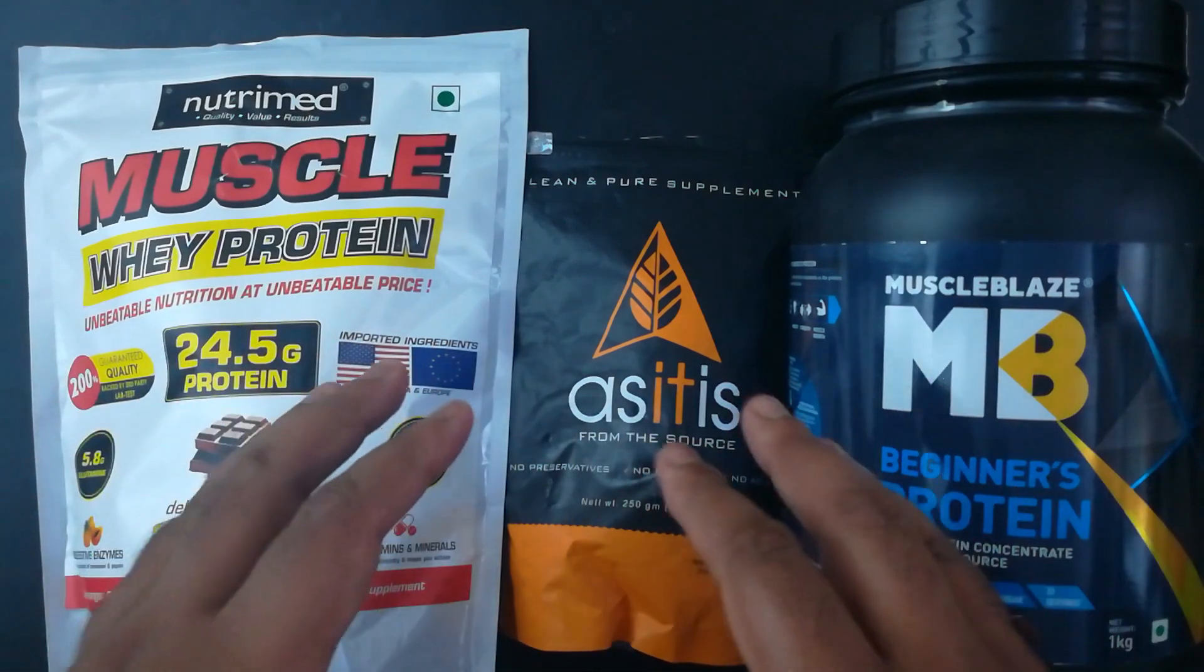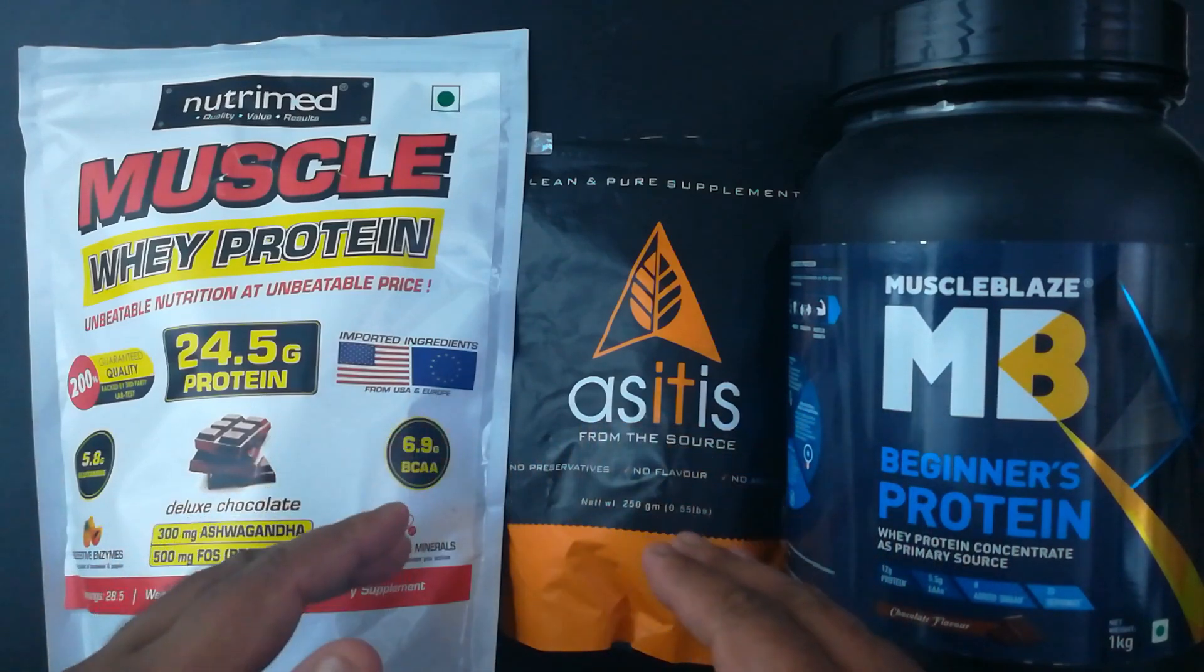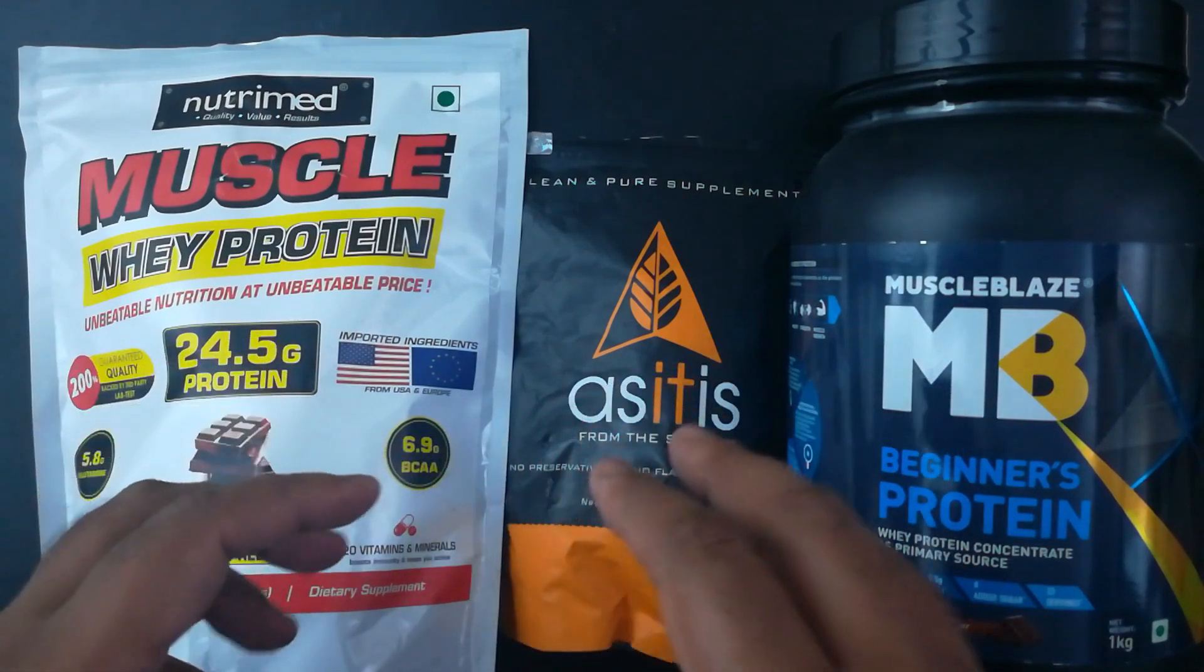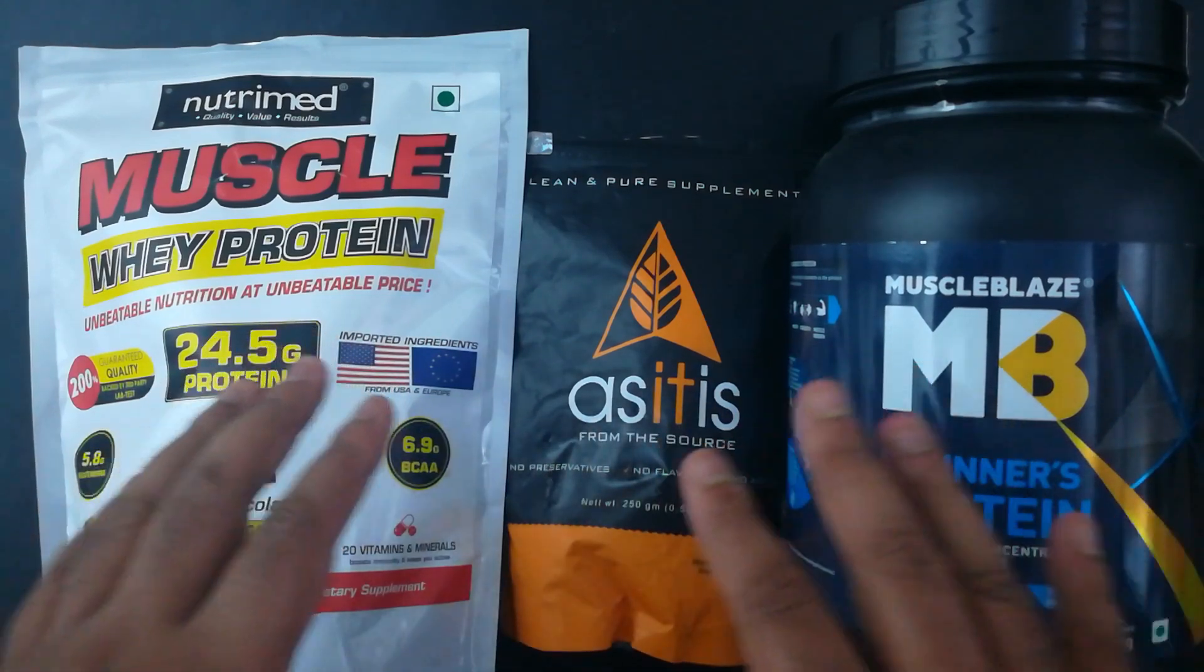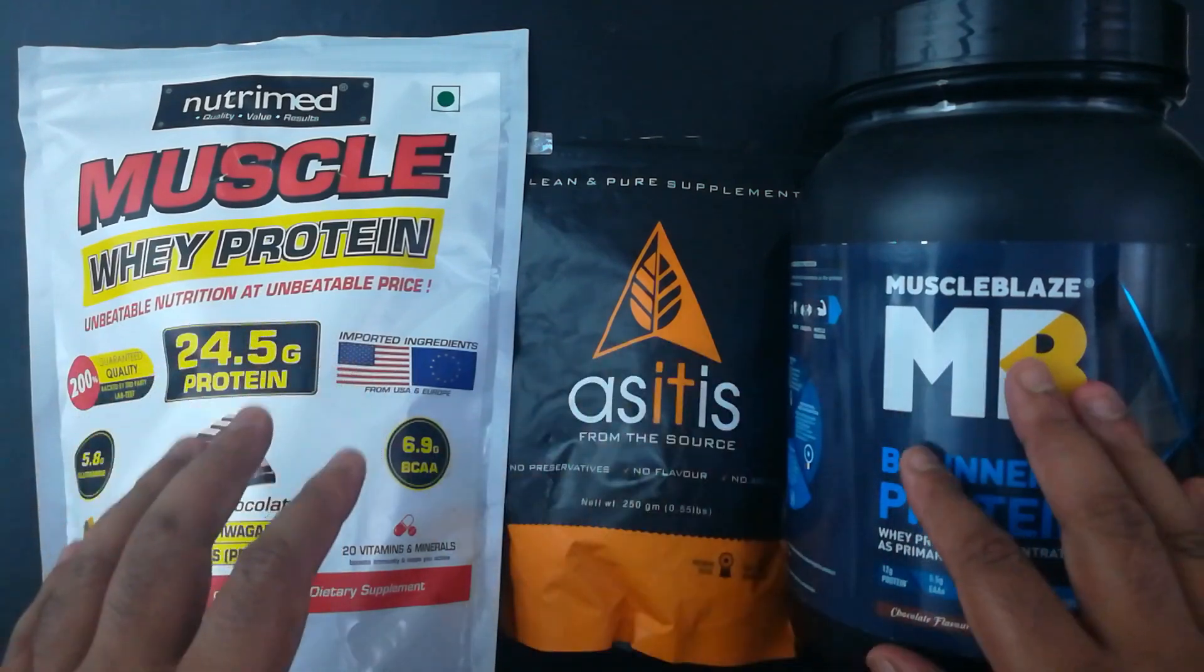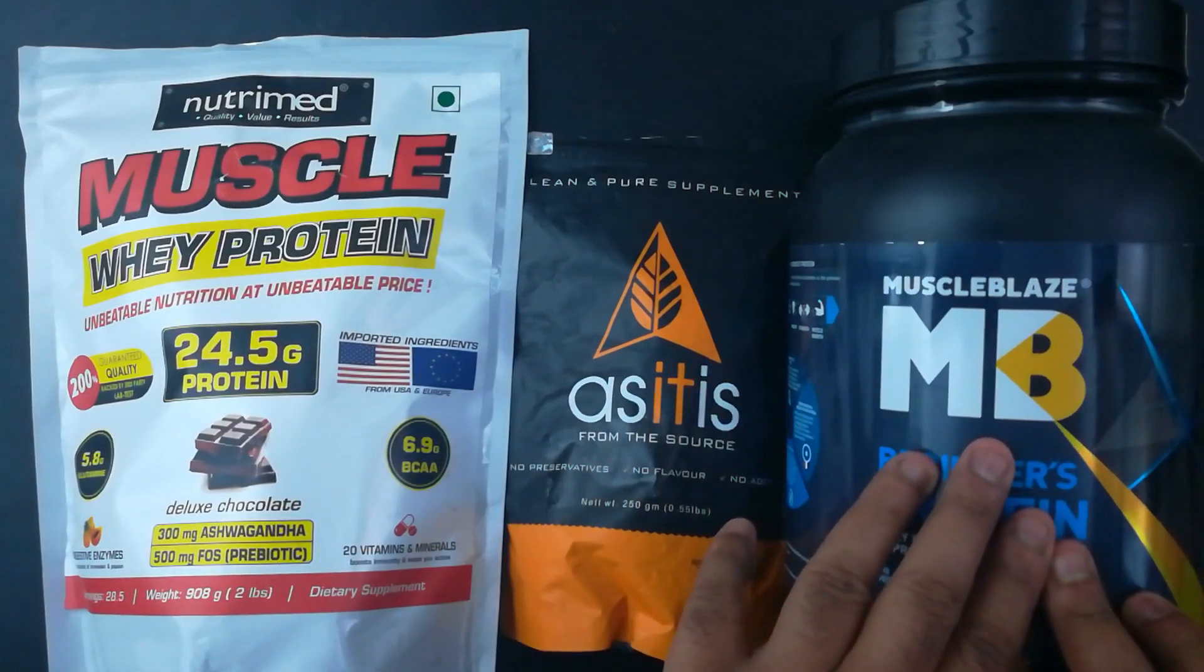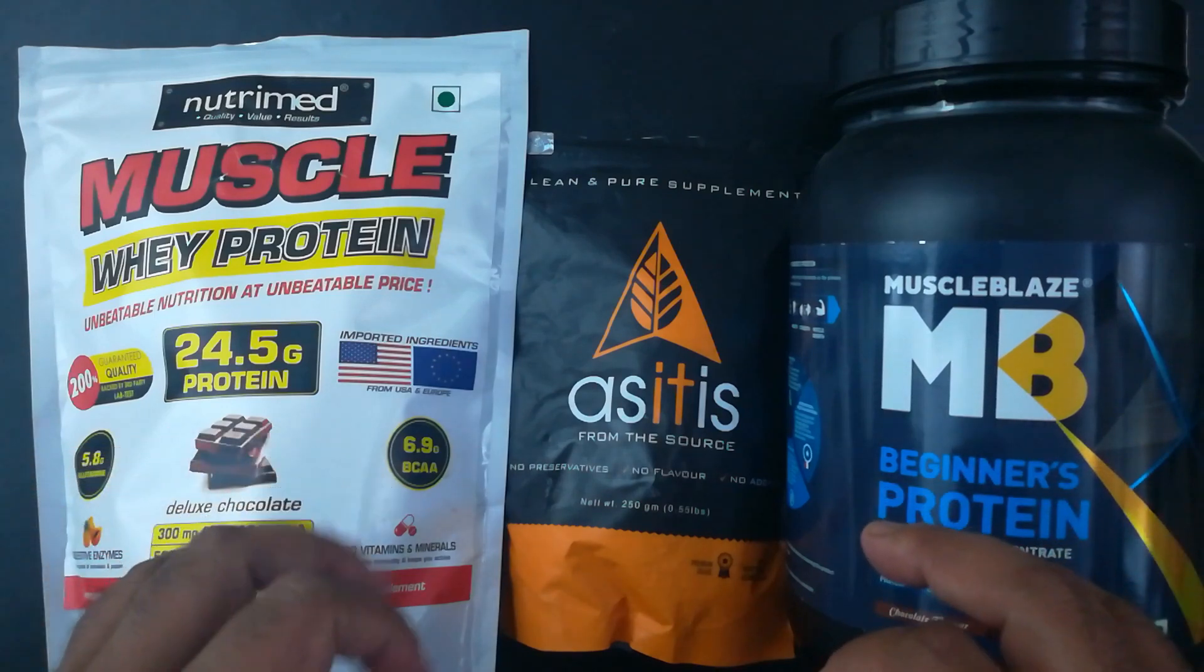But I believe that I found a way in which I myself can be assured whether they're putting certain extra things in the products or they're at all giving us whey protein or not, at a level that not even these companies have ever imagined that someone's going to find out. For this beginning of a series of videos, I'm introducing Nutrimed Muscle Whey as it is raw whey isolate, and Muscle Blaze Beginner's Protein. That's how different they are under a microscope.